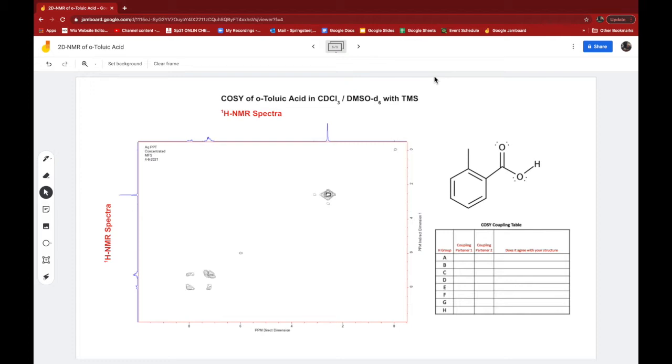So let's label the hydrogen signals as we normally would. This would actually be signal B right here, because A was cut off. A's over at like 12 parts per million. A is cut off. And so that's B, C, D. So I've got that labeled.